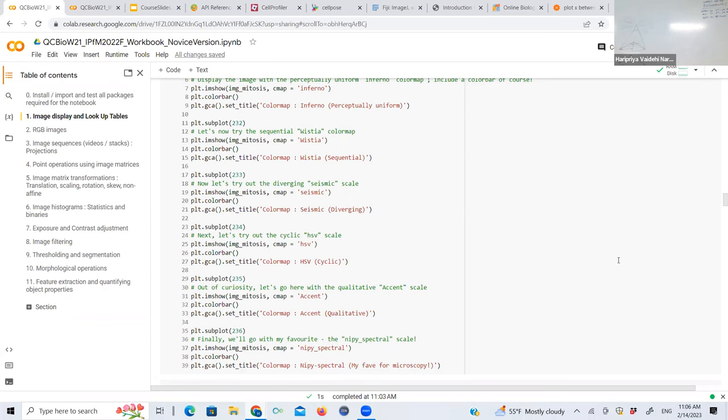Whereas if you want to quantitate something exactly, or to segment something, to identify those things, it's very convenient if you just flip and invert your image, and then you can pull out those bright spots. Say you have an algorithm where one way of thresholding is to just pull out minima. If you want to pull out your bright objects as minima, you need to flip them and make them dark objects, and then you can run your algorithms. So it depends on your pipeline.